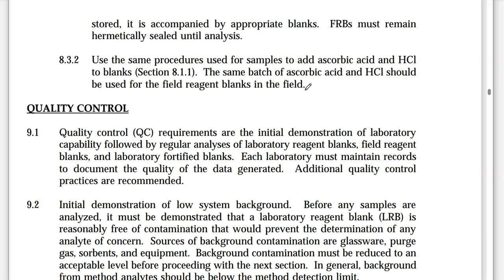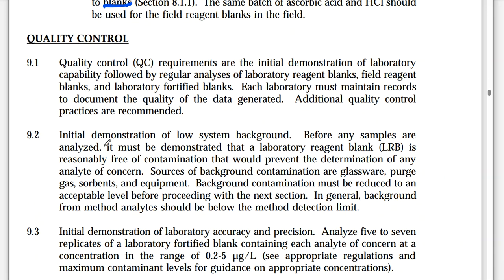So this is an idea, again, that if we're going through these extra steps when we get samples out in the field, then our blanks should really be following the same exact process. So the blanks, even though they're blanks, they have to be exposed to the same types of things that our samples are. From the very beginning, from the collection all the way through the processing, through running them on the instrumentation, they really do have to be exposed to everything that a sample would see and touch and feel throughout the time. Next up is the quality control section of the EPA method.